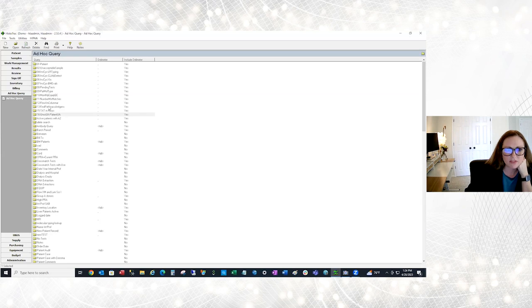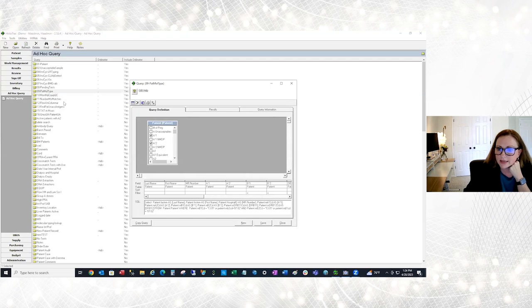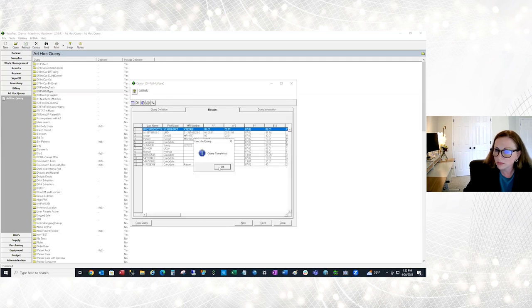One other one I want to just show you real fast, because I think it becomes pretty helpful, is if you needed to query the data back on a patient where they have a certain typing, right? So in this example, I want to find any patient that has a 1301 and or a 702. So maybe you need to pull back a certain subset of patients. So in this query, I'm getting that traditional typing A, B, and DR, but I'm only returning the patients that have the 0702 or the 1301.